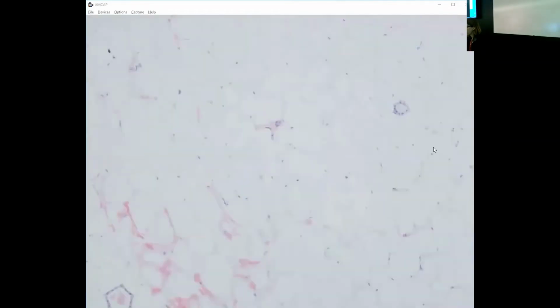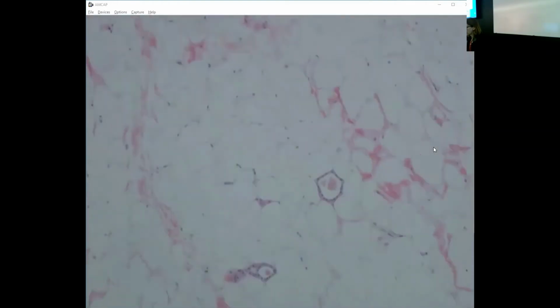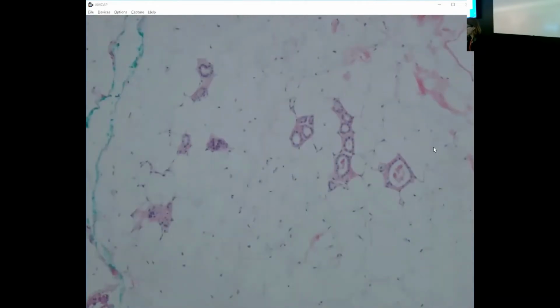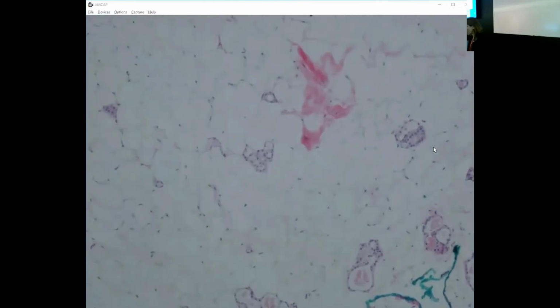But at present, we call this microglandular adenosis, although work from Eddie's institution is questioning the whole total benignity piece of it and whether it might be a non-obligate precursor lesion, because we do see atypical forms and we do see forms associated with triple negative cancers and other cancers, metaplastic carcinomas. So there's something unusual about it for sure. So that is one example of MGA.